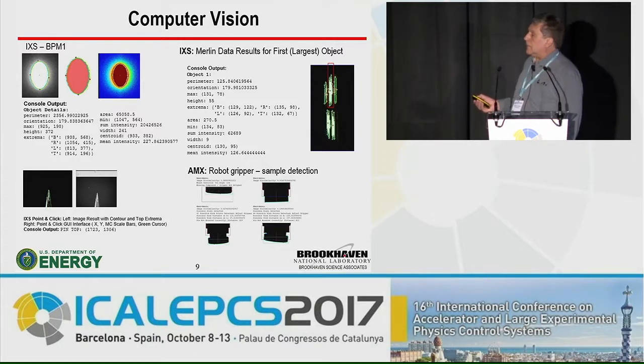characterizing the analyzer of the inelastic X-ray scattering beamline. There's 6 crystals back reflecting the beam. They are slightly detuned, so the beams are not overlapping. Normally they would be basically, one would be in the center, the top ones would be shifted down. We're detuning so we could separate each energy. And then Python provides a lot of parameters about the beam itself.